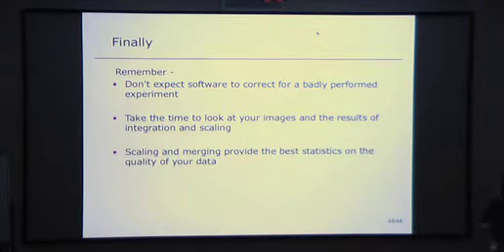Take the time to have a look at your images and the results of the integration and the scaling. And although you get some stats from the integration step, it is the scaling and merging step that gives you the best stats on the quality of your data. And I think at that point, I'll stop.